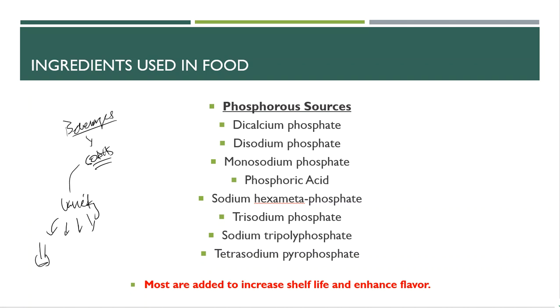You are going to probably dilute those down. You can't run those straight right out of the bottle, right? So you're going to have to filter them or dilute them down or do something with them. And we're then going to take those and run them on the IC instrument. And we're going to look for the phosphate peak that shows up on the IC equipment. And we'll compare them. Which one of these drinks had more phosphate than the other? And then we'll rank them, and I'll share with you what brands they were after the fact.